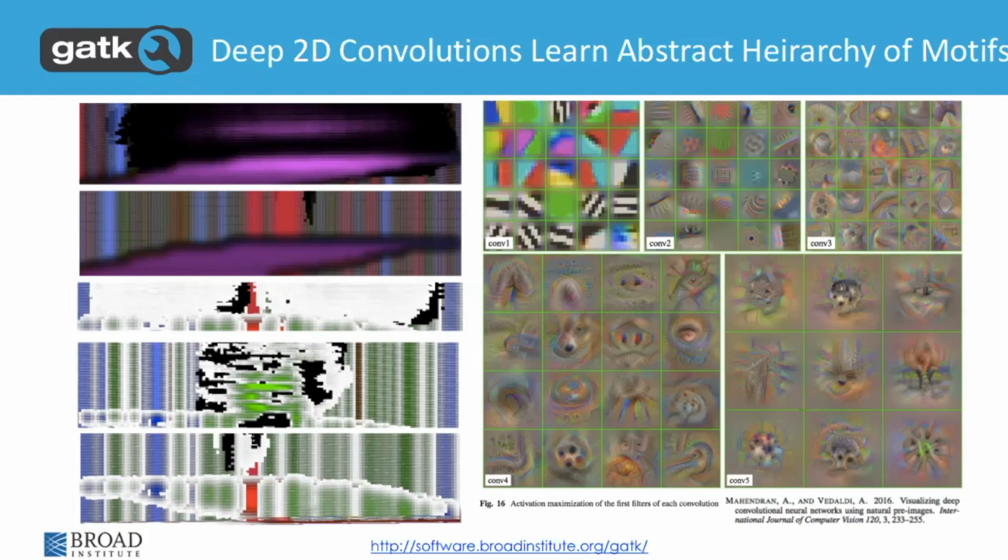And the idea is the same for our convolutional neural network for variant filtration. We start with very, very rough feature finders that say whether we have a certain signal or not. And then once we get deeper and deeper, we get into more granular shapes that look at the specific context around our variant.